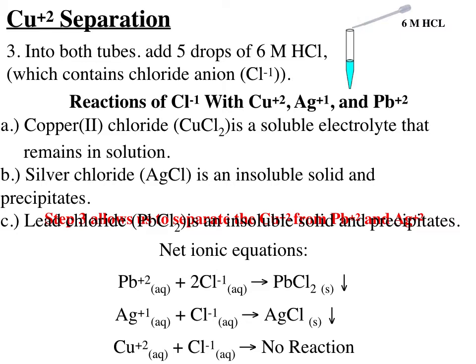So the vast majority, almost every ion of lead and silver, forms a solid which is more dense than the aqueous medium around it, and it sort of rains down out of the liquid environment in which it is being formed.